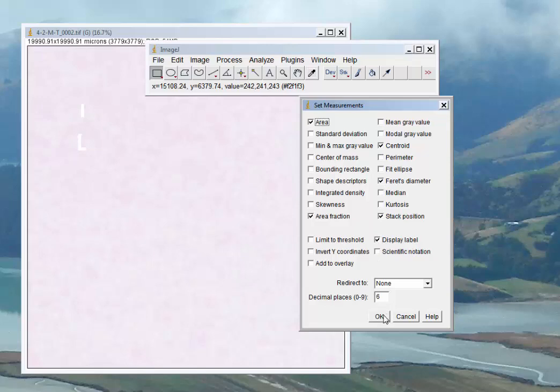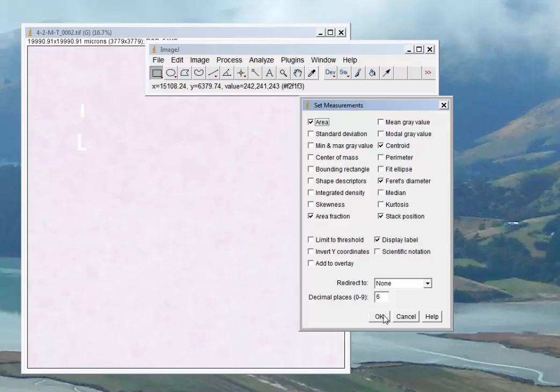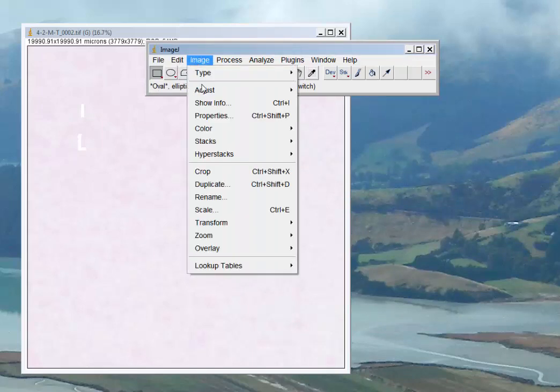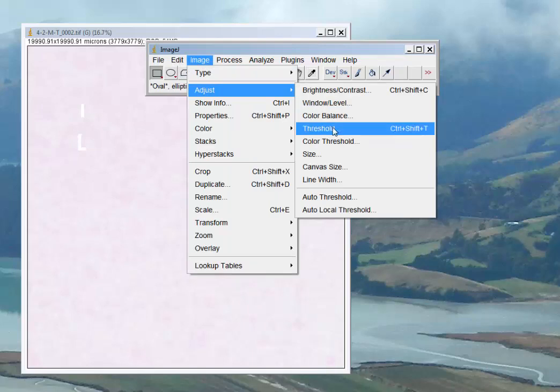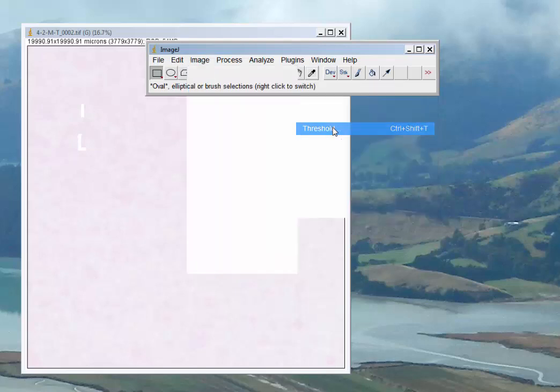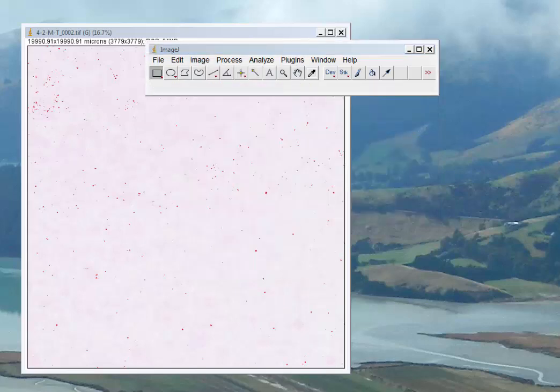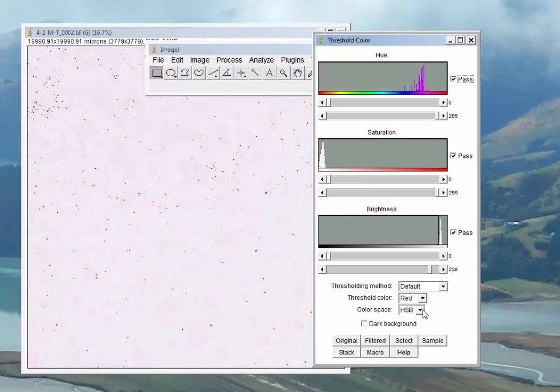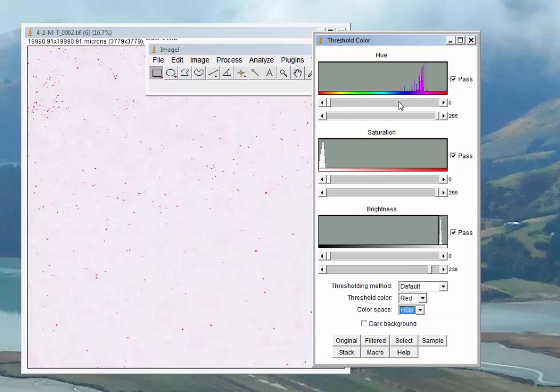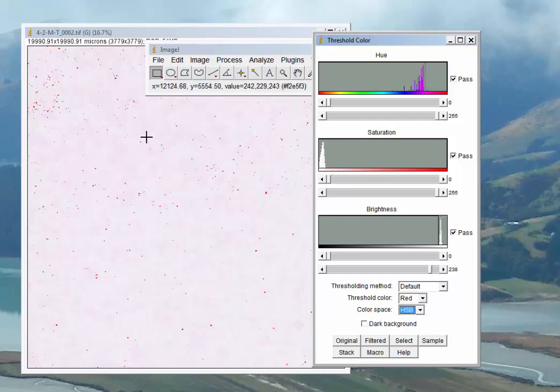We're going to go over to Image, then Adjust, and Threshold. Threshold and Color Threshold are pretty much the same thing. We get our HSB—hue, saturation, and brightness—thresholding window. If you're on a different color space, make sure you choose HSB.